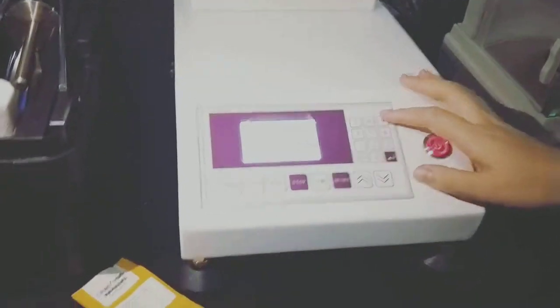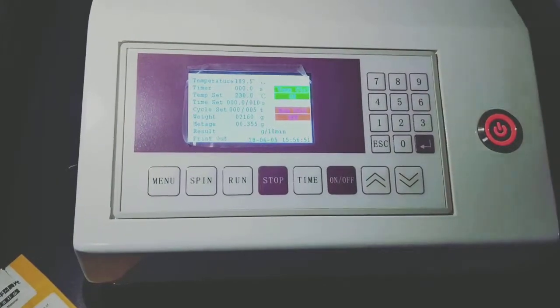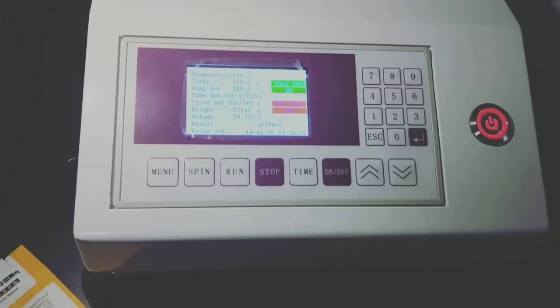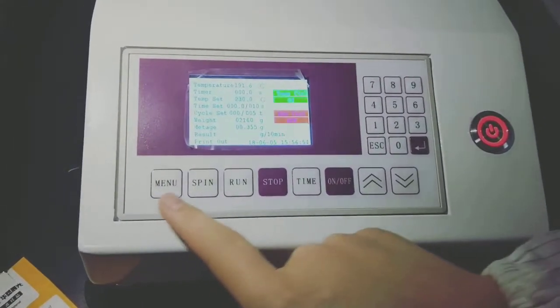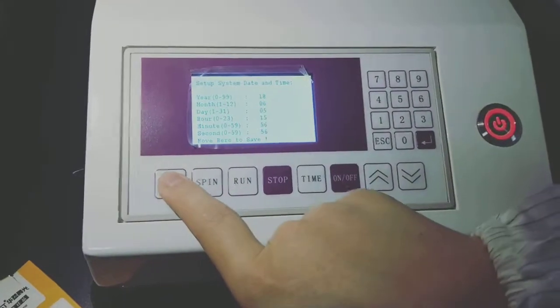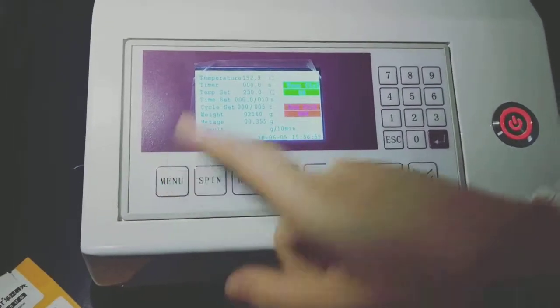There are 10 number keys used for inputting the temperature or other values as we need. This is the main menu key. We can set the parameters.